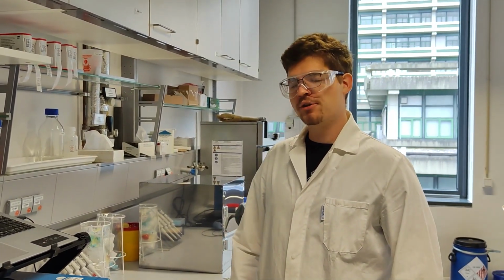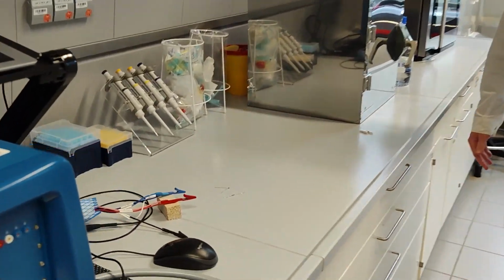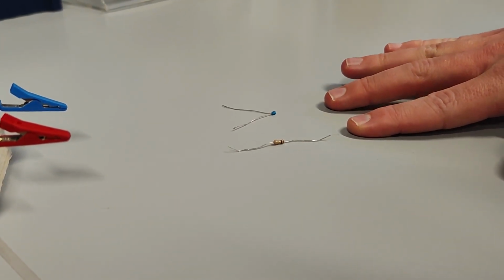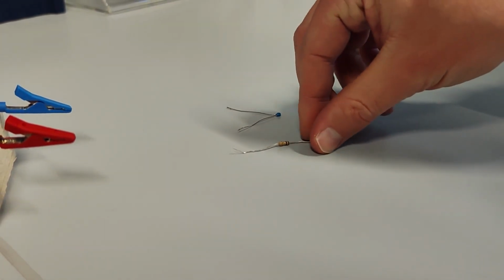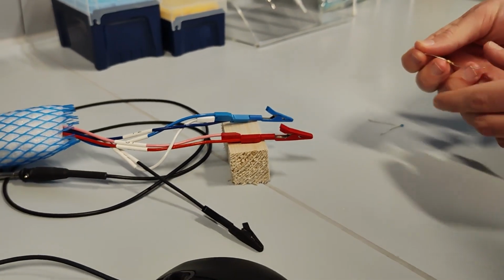Hello and welcome to our lab. First, I would like to show you how actual circuit elements look and how they behave if we apply a real step function with a potentiostat in a lab. You can see here two examples of such elements. The first is a resistor of resistance 1 ohm, and the second is a small capacitor with a 10 nanofarad capacitance. I will now connect first the resistor with our potentiostat to apply a voltage over this resistor.